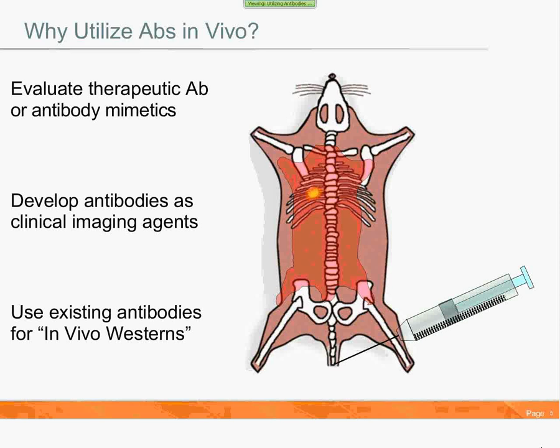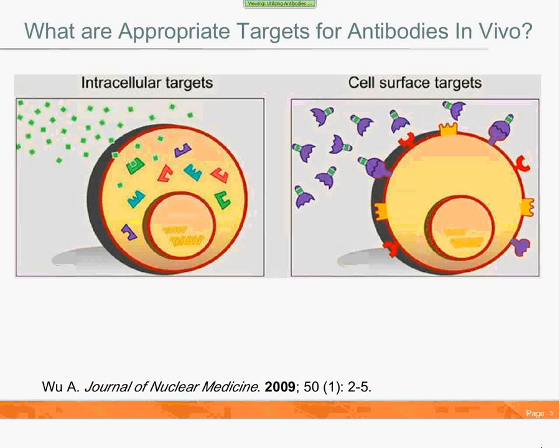One can utilize visible fluorophores, particularly for high abundance proteins, as I mentioned, actin or tubulin. These are also fine for FACS or immunofluorescence, but really for in vivo, they aren't optimal and really shouldn't be tried, fundamentally because you have such significant autofluorescence and limited tissue penetration of both your excitation and emission light. If you label your antibodies with near-infrared fluorophores, these are appropriate really all the way across the board. This is where you want to work in vivo because, as you know, your excitation and emission light is able to penetrate better, and the relative amount of autofluorescence found in tissues in this region decreases significantly as well.